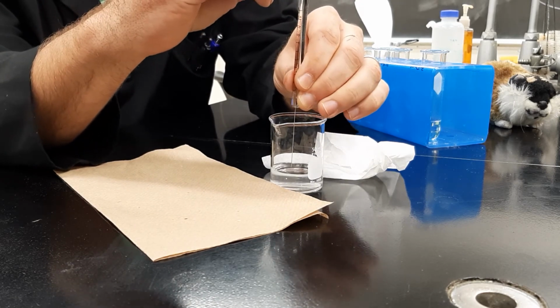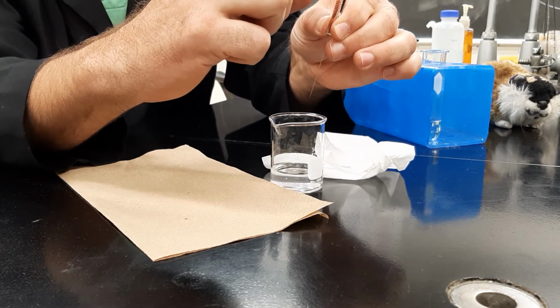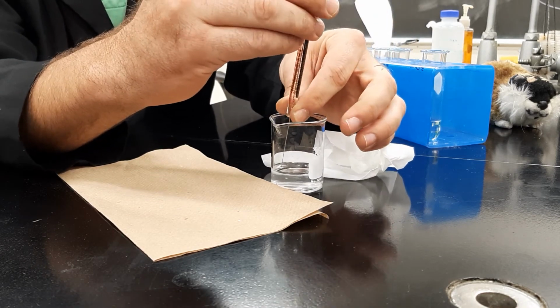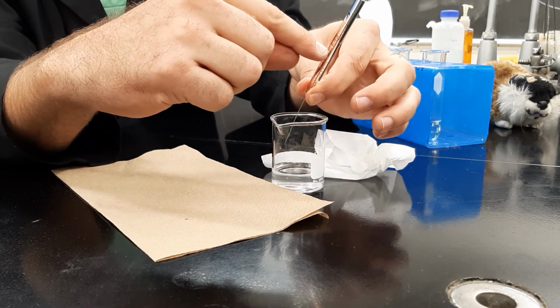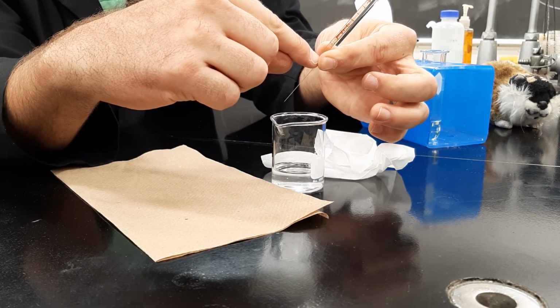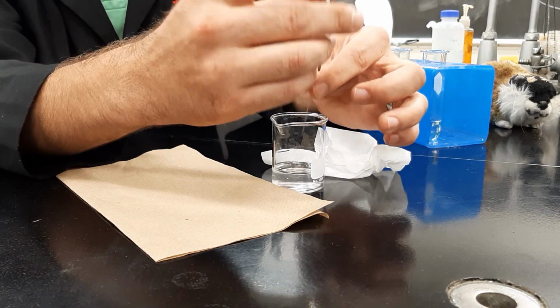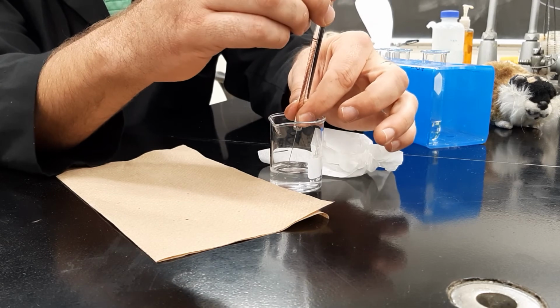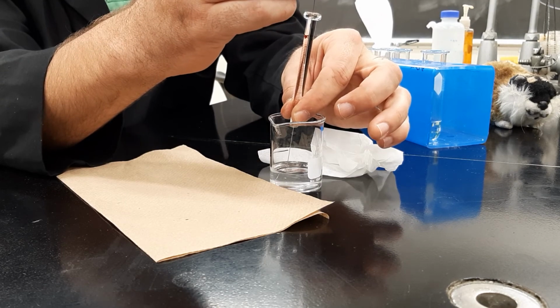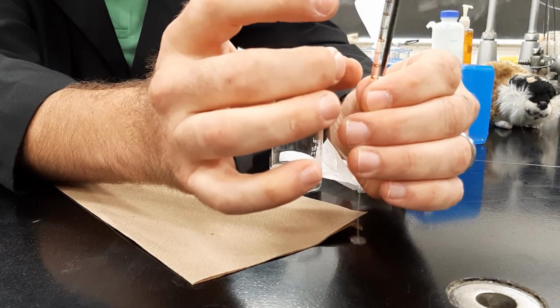If it's up by the barrel, some people will measure to the air bubble and then push the air bubble down. It's not an ideal situation, but you may have to do something like that. Just go ahead and leave the air bubble in. You'd measure from the bottom of the air bubble and then make sure the air bubble just goes to the top of the needle, which is actually right here, just back to the 0 line. But ideally, you would work hard to actually clear the air bubble here in this instance and not have one if at all possible. Or have the teeniest, tiniest kind like that you can actually go ahead and clear.